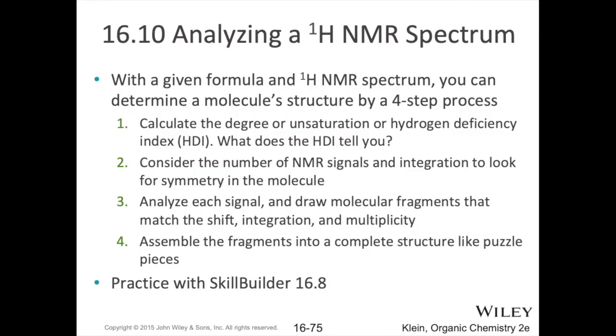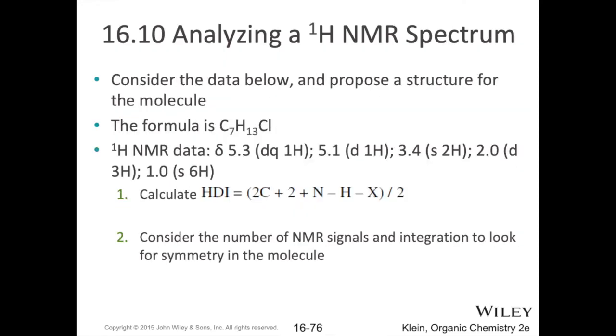All right. So yeah, let's try and piece all of that together and do a practice problem involving all of those. So here we have a molecule with the formula C7H13Cl, and we are given its NMR data. Let's start off by figuring out the degrees of unsaturation. If we've got 7 carbons, 2n plus 2 is 16, so there ought to be 16 hydrogens. But there's only 14, right? If you treat the chlorine like a hydrogen, that tells us there's 1 degree of unsaturation in there.